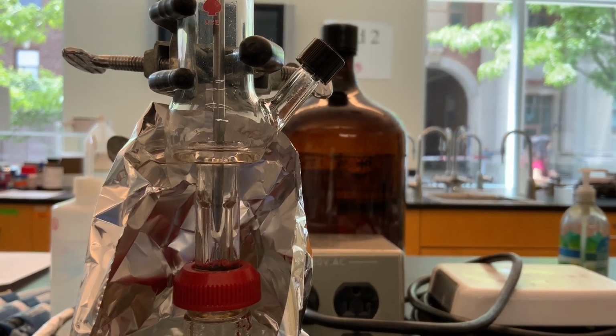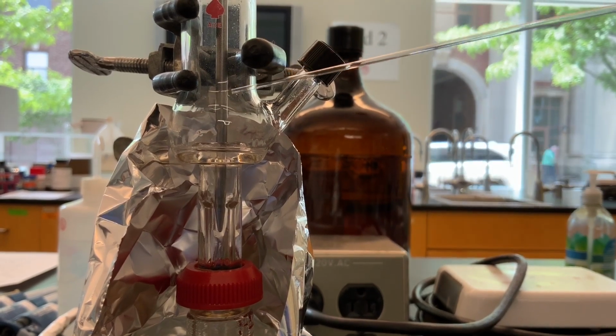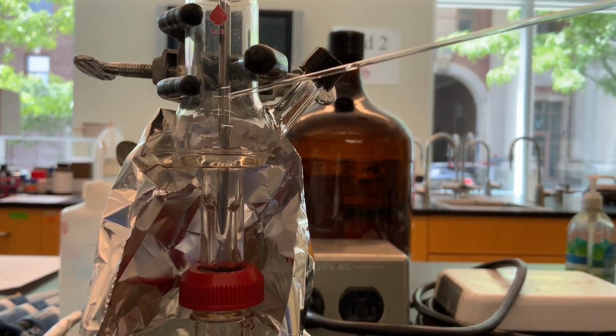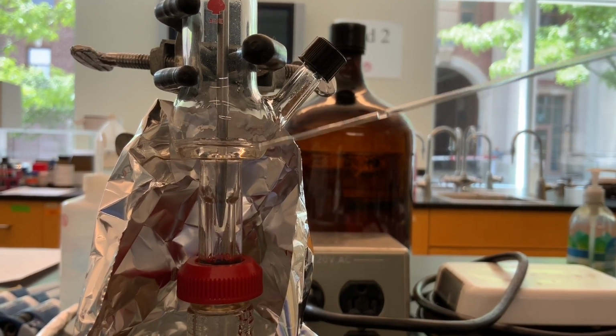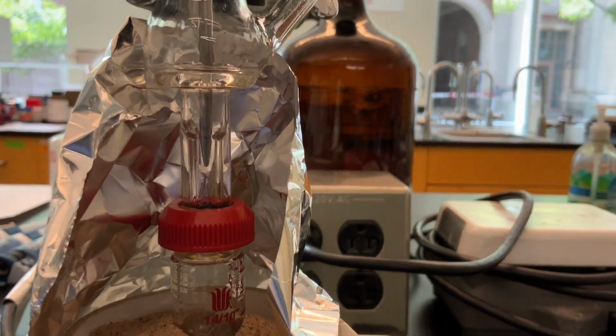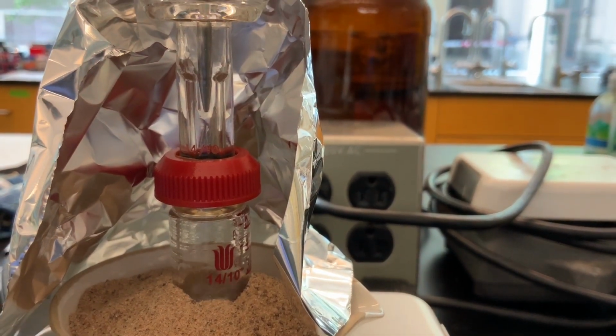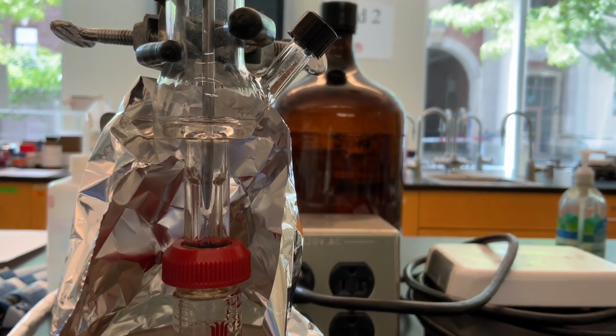But it's pretty cool to see the vapors of toluene have now reached this level and are falling down and collecting here. The well hopefully is not too shallow for it to then just fall back down in there, but we shall see. Because then we're just achieving a reflux rather than a distillation.